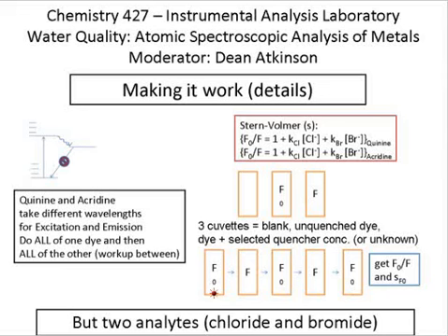So what you've done is you've bracketed 2 sets of Fs with F naughts, and to get the actual answer, you would take the average of this F naught and this F naught for the F naught, the average of this F and this F for the F, and therefore your overall F naught over F is an average of several points, which makes it a lot more certain.